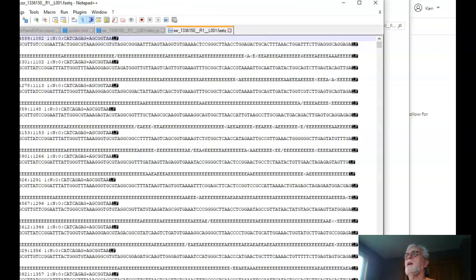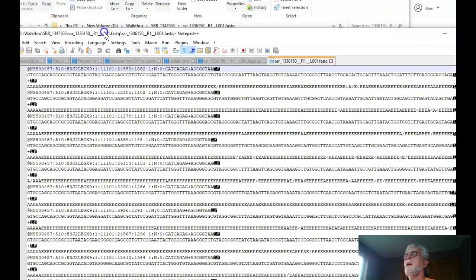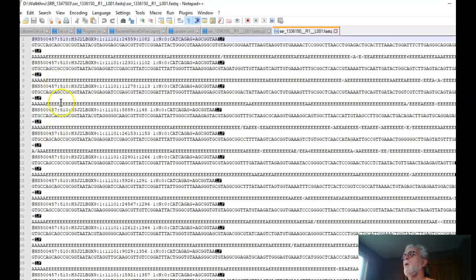Let's do a quick edit of the data. And here's what we have. And what we have here, for those of you who are literate, is a DNA sequence. So what we have is a variety of different DNA sequences, and these DNA sequences are what is being matched up to determine which bacteria is involved. Half a gigabyte, 500 megs of data is involved. So it gives you a slightly different perspective of the services that they are offering.